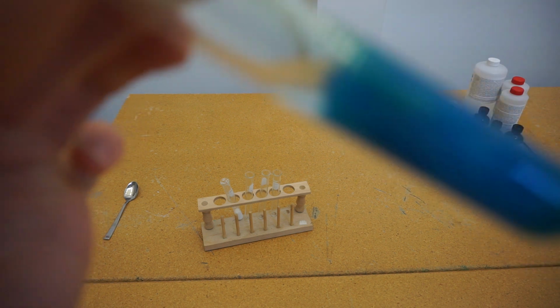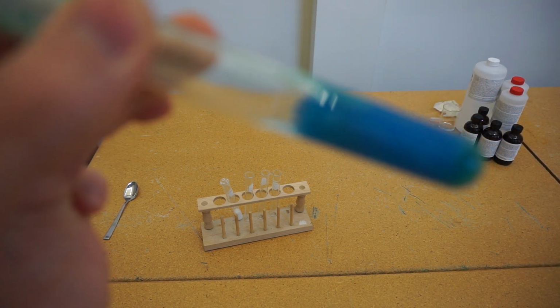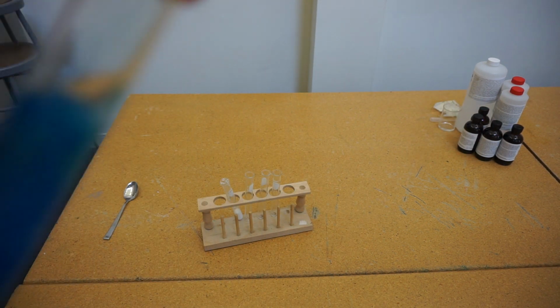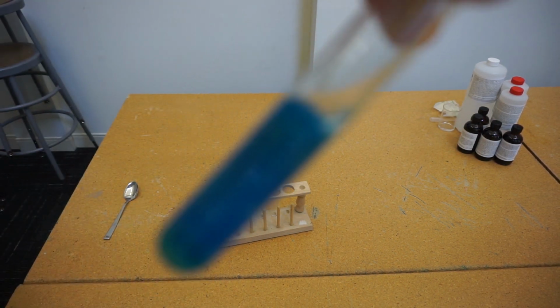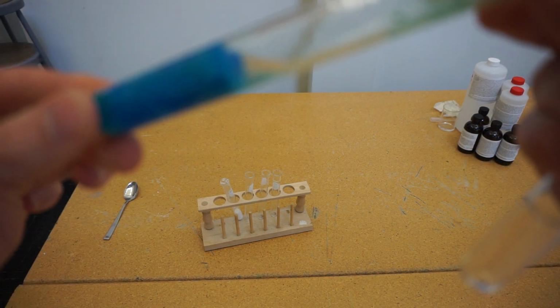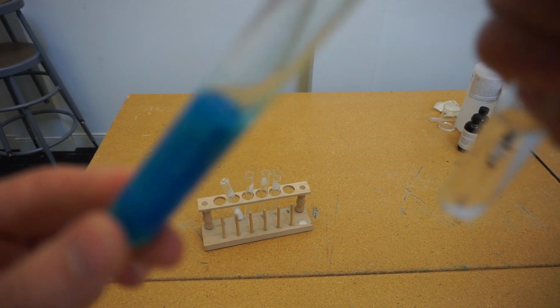And you can see there we're now getting a colourless liquid and quite a lot of blue solid, and the formation of this precipitate again is a clear sign that we have a chemical reaction taking place.